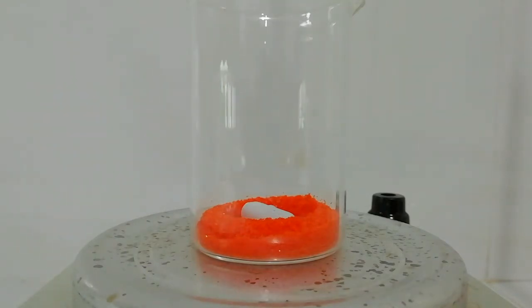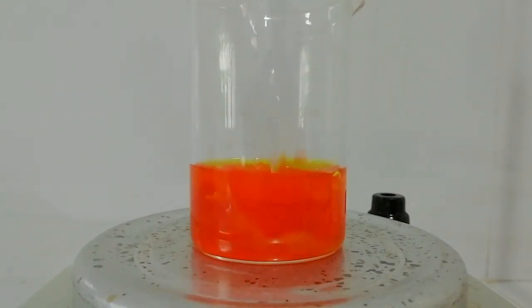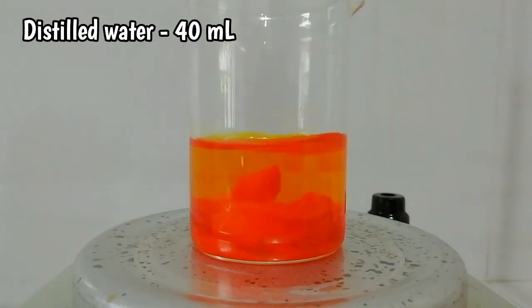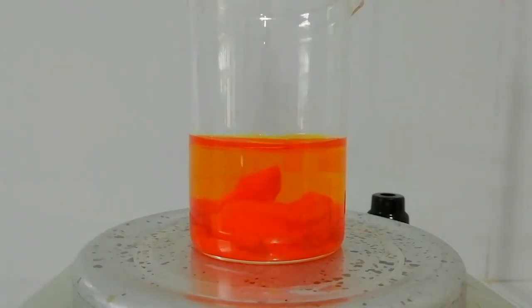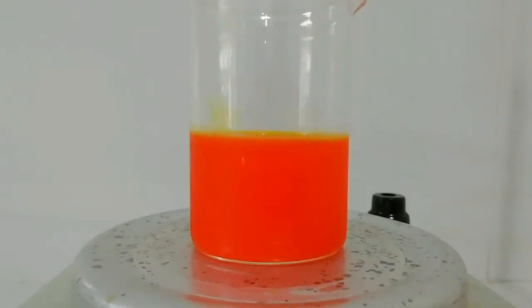I'm going to add 40 milliliters of distilled water here and start stirring. You can see the potassium dichromate is dissolving in distilled water. Now I am going to add about 7.6 milliliters of concentrated sulfuric acid into this mixture.